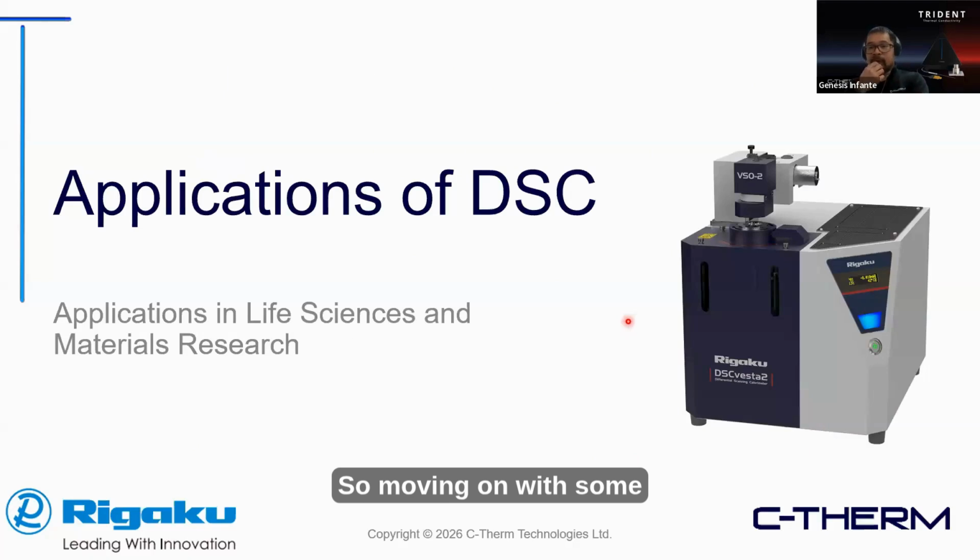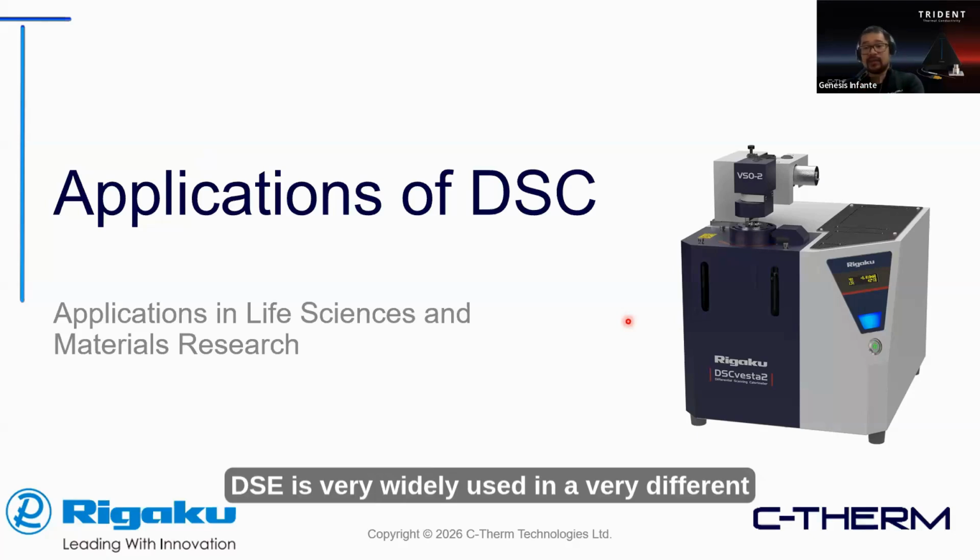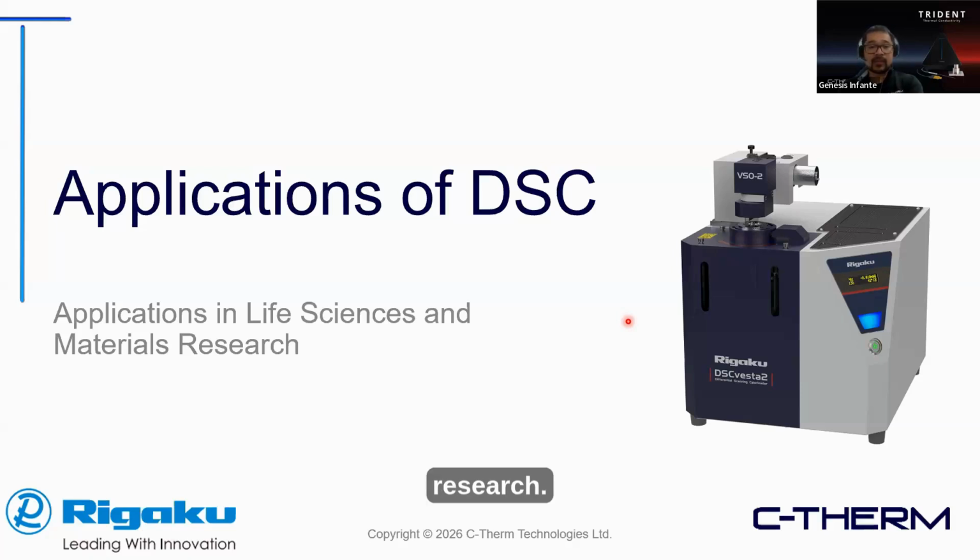So moving on with some specific examples right here. I'm going to be highlighting some. DSC is very widely used in very different spaces, a lot of them in polymers, and it could be in other material type studies. So I'm going to be picking some of these very common examples done in literature and in industry in general, related to life sciences or materials research.